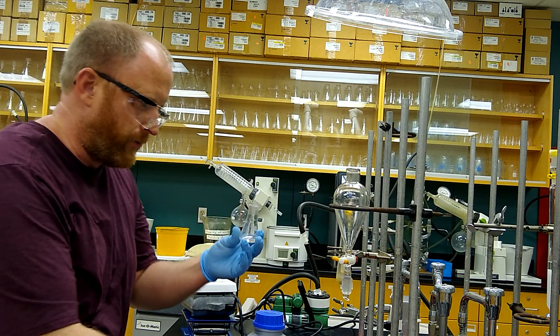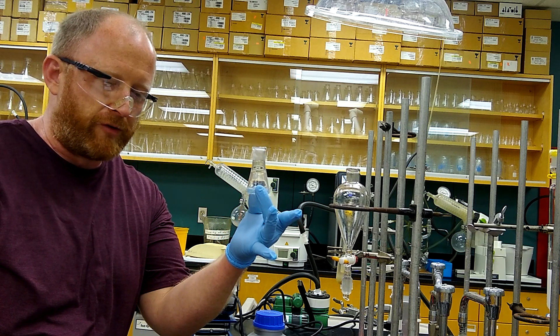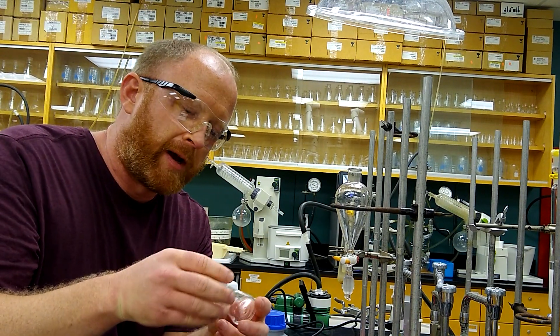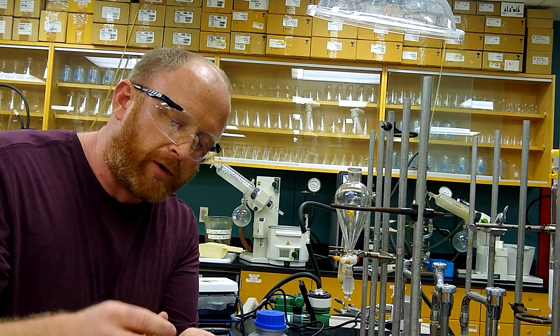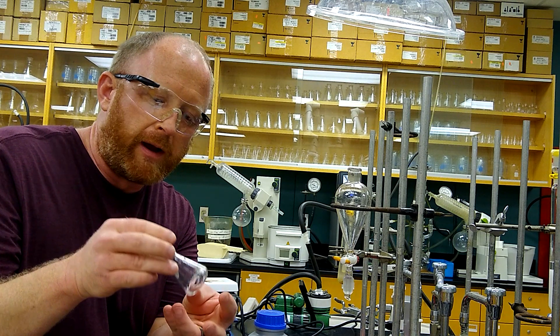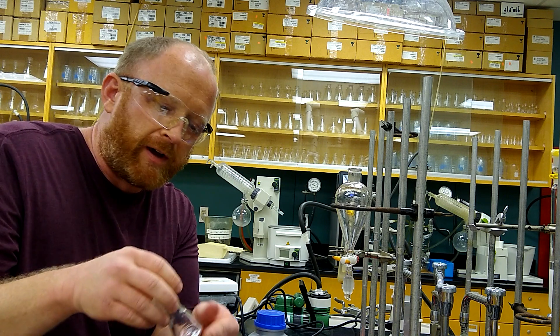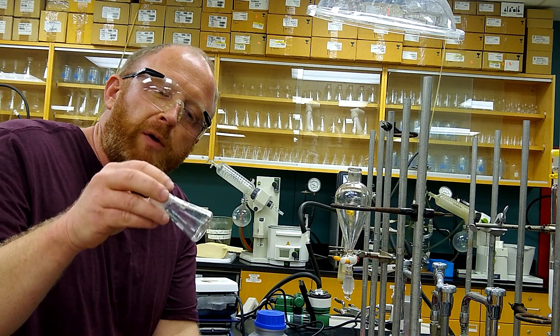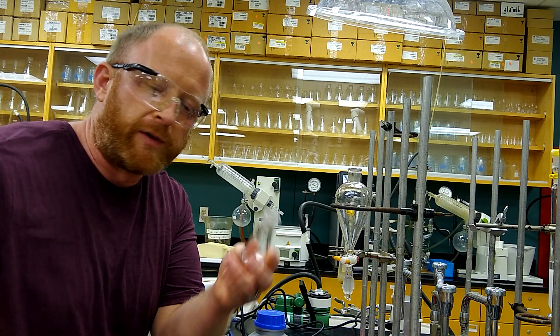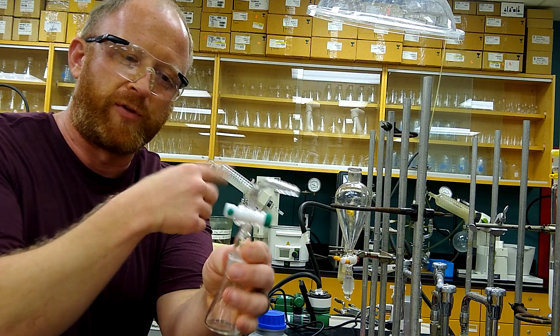Now we're just going to evaporate this down to dryness on the rotavap. After the rotavap, because ether boils at about 35 Celsius and the bromopropane that might have been in the ether along with your product boils at about 71, most of that should have come off on the rotavap. Just to be safe, we're going to put this on the vacuum pump with this little vacuum adapter, so we just hook it up to the vacuum pump and open it up to the vacuum.